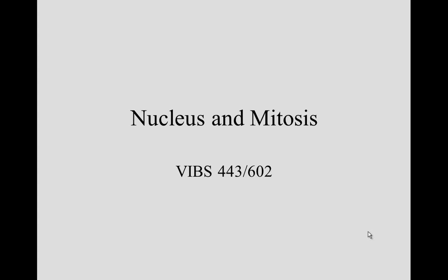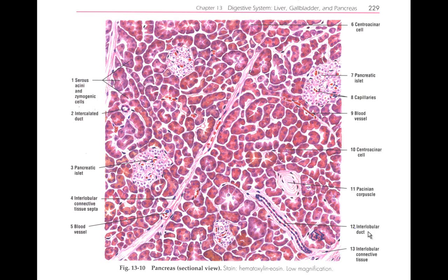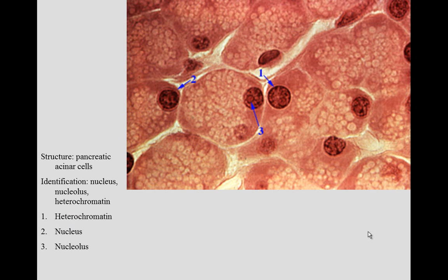Nucleus and mitosis. Here we see the pancreatic acinar cells and we've been looking at those cells for the cytoplasm. Today we're going to look at the nucleus of those cells.